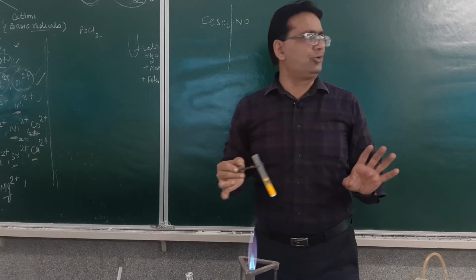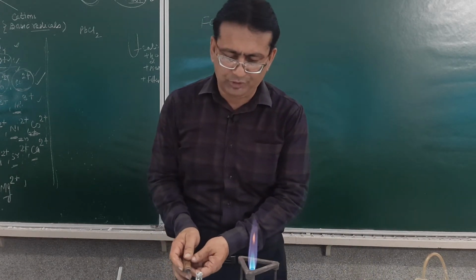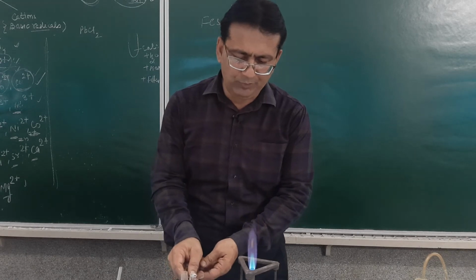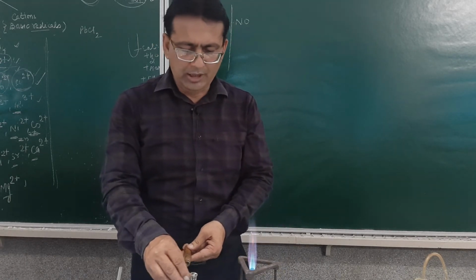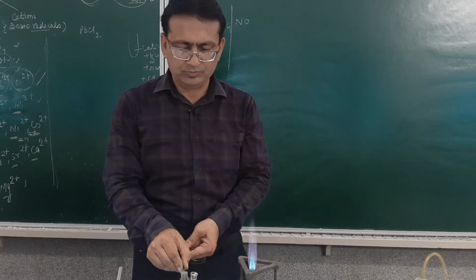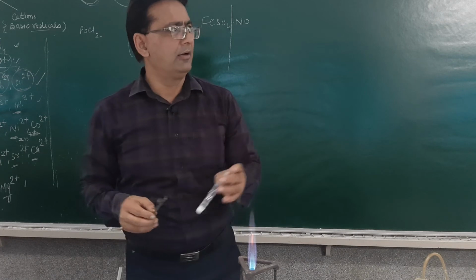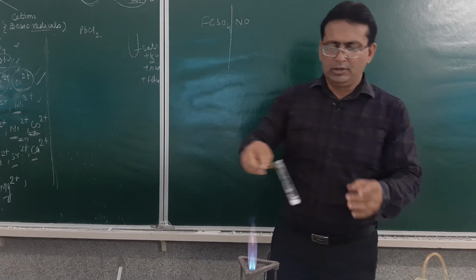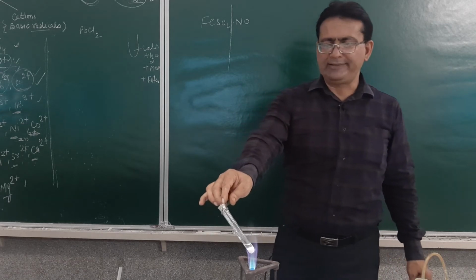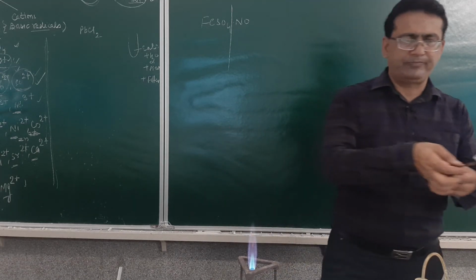Similarly, you will be able to obtain the test, with the clarity with which I am able to obtain it with no error. Similarly, if you practice, the same will be with you. Now, we'll take the second test tube. In the second test tube, what is to be added? We'll add potassium chromate. In the second test tube, we will add potassium chromate.